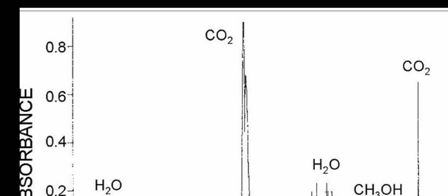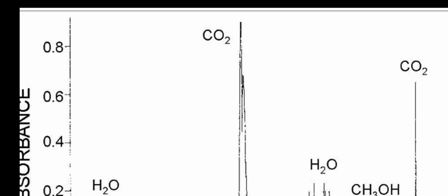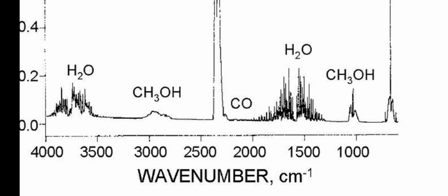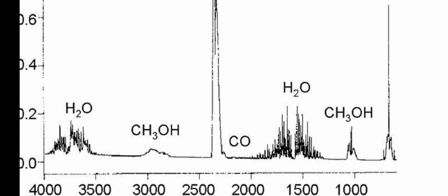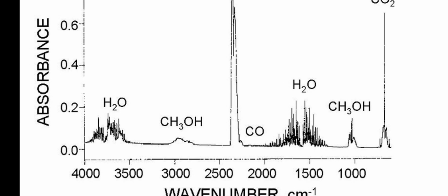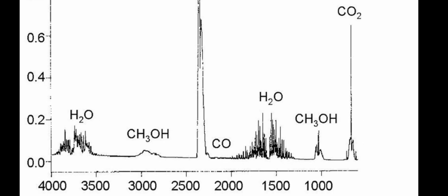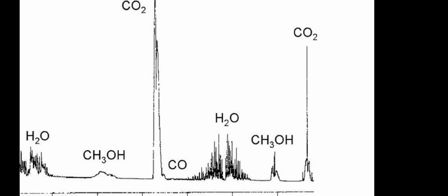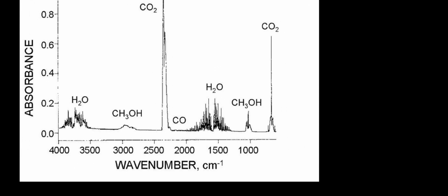Now as for CO2, it contains a dipole moment, that's why its peak is the highest peak, with 0.8 absorbance and frequency around 2300 centimeter inverse. Now again for water the peak is given, and for methanol also this peak is given, and for carbon dioxide also the peak is given.